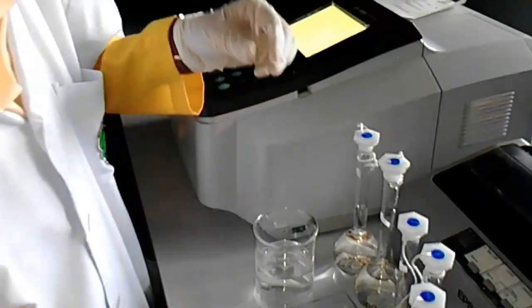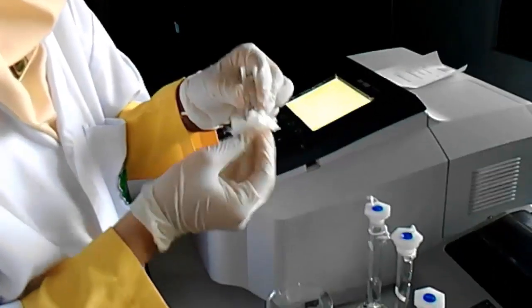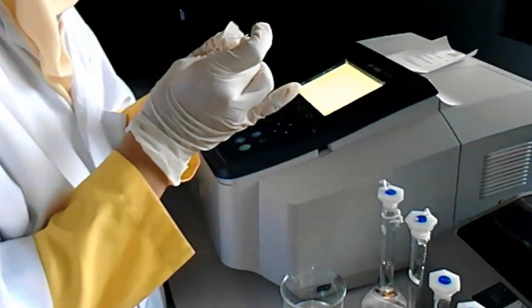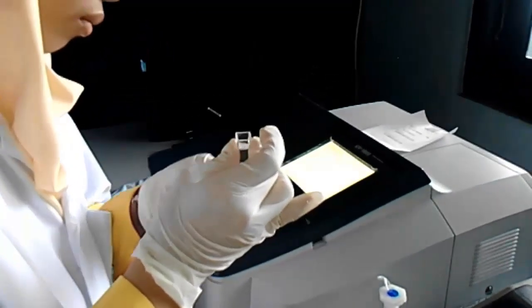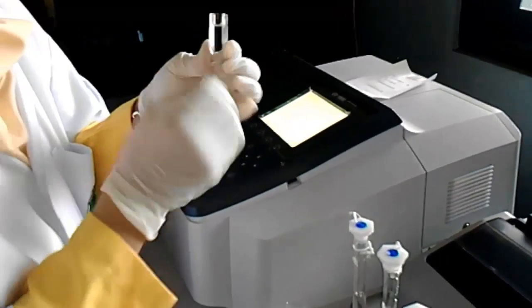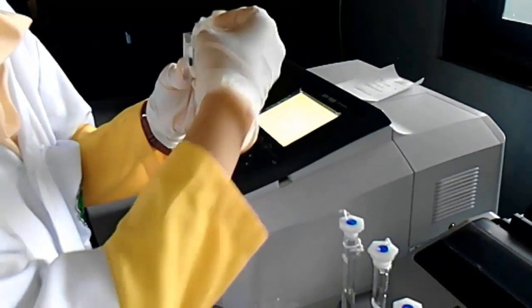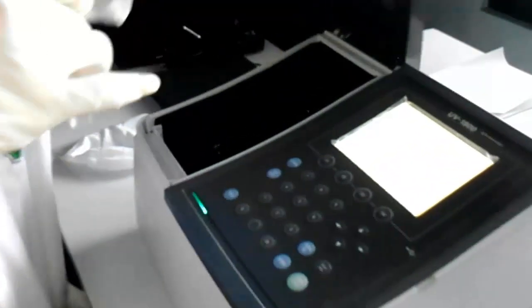Wipe the clear side of the cuvette with tissue. Then put the cuvette in the measure slot of the spectrophotometer.